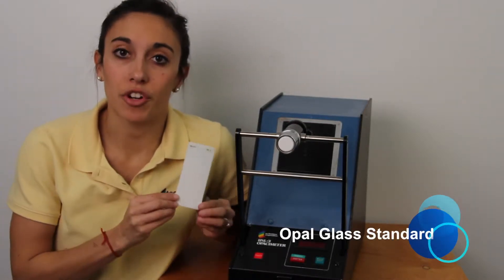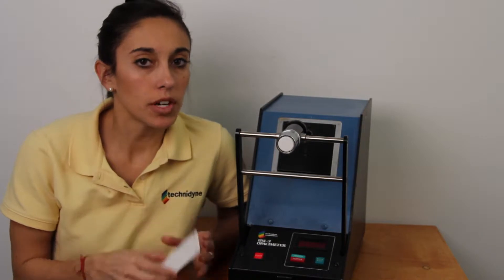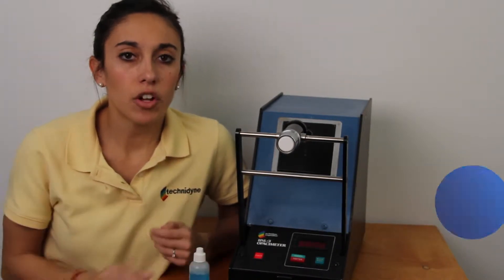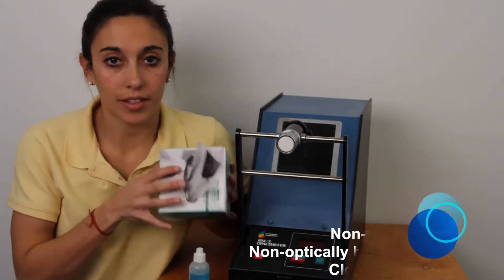The first thing that you should have on hand is your opal glass standard. It's important to make sure that the opal glass standard stays clean, so you'll want to have a cleaning solution and non-abrasive, non-optically brightened cleaning wipes.